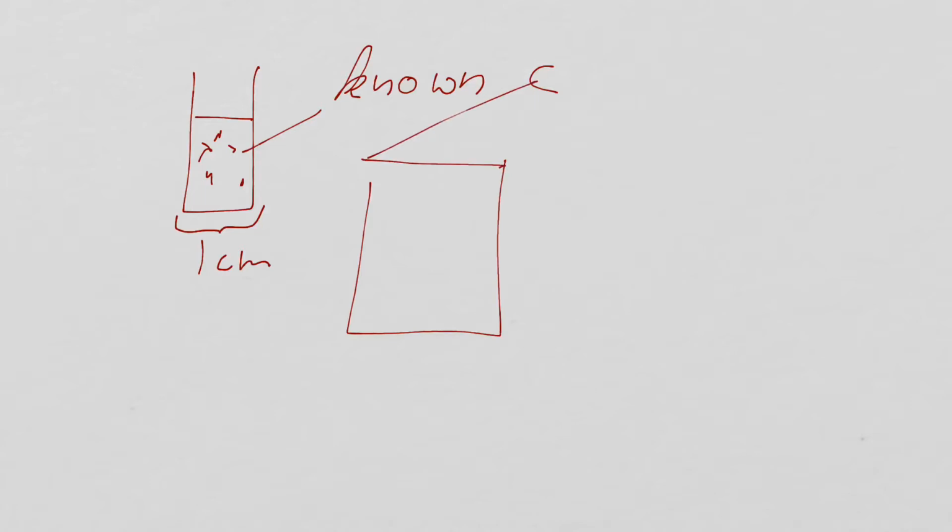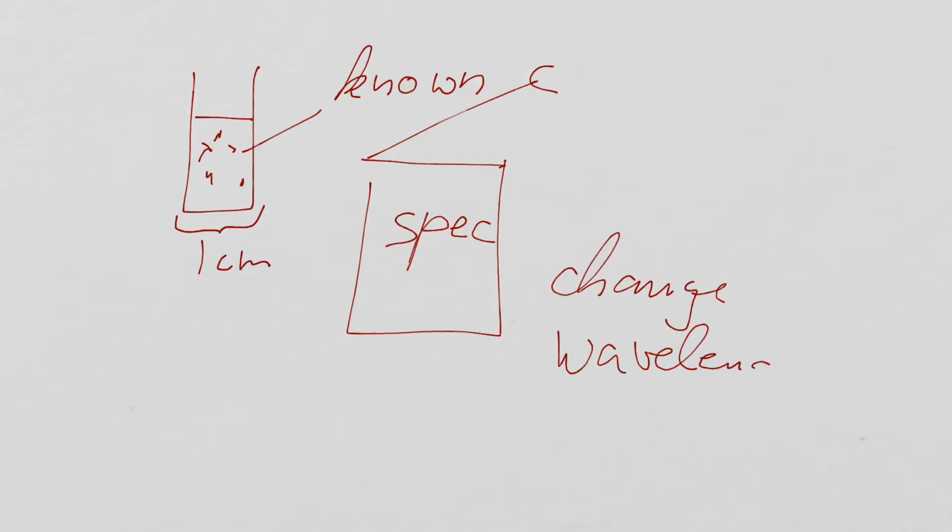And then we step by step change the wavelength. What do we get?